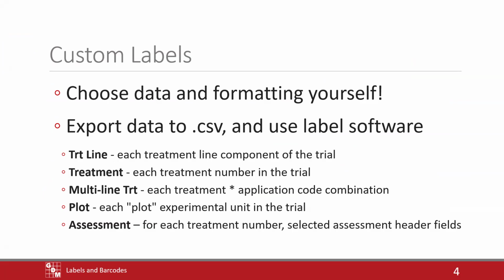Like I said at the beginning, hard-coded, the programmers have to construct the code behind the scenes to put those pieces together the way they were requested. And that worked for some years. They're general enough. We built up enough of them to be good enough for a while, but it got to the point where more people were using them, and we just asked ourselves, well, it's silly. When someone wants it, of course, it's the time that they need it. We can't just spin one up immediately. It takes time. It'd be a whole lot easier if we just handed the keys over for anyone to make their own label.